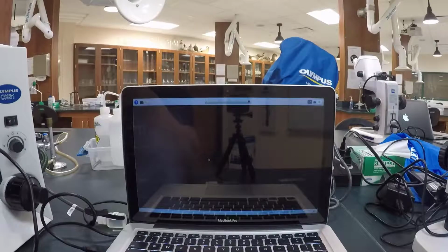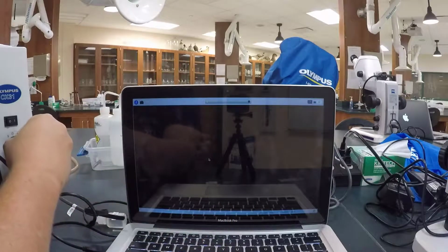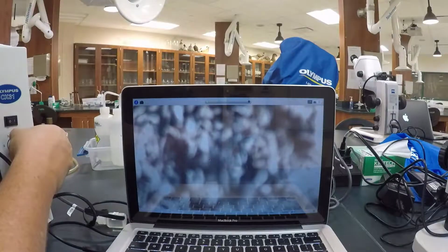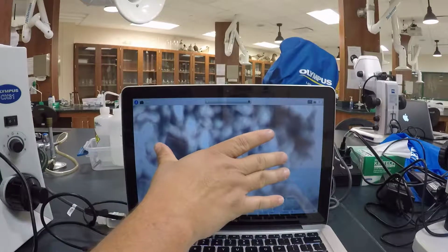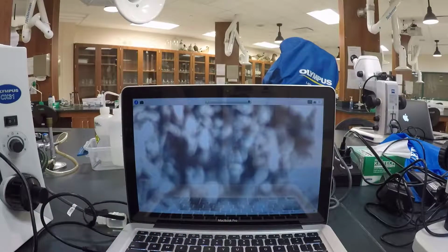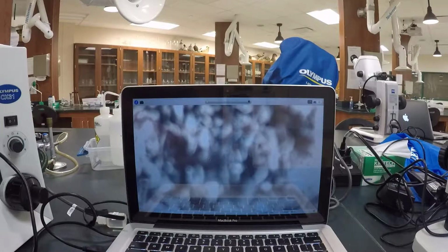you to determine, because there you might only see black. So this is only black here. I'm going to increase the light. So you got a little bit of white over here and an entire black line, and maybe a little bit of white over here. So under 400 times your eyesight, your field of view is less than 1 millimeter.